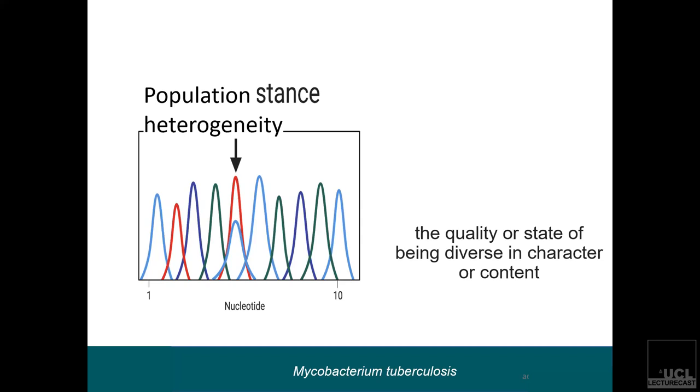We tested the PCR version out, but you get more gaps. For some reason the PCR just doesn't work as well, and you get a lot more holes. I've got a really good example of the rpoB gene with the native kit: you get coverage all the way across, like pancakes flattened across it. With the PCR one, you just get a stack of pancakes and the rest is missing. So if the resistance SNP is in a region that is missing, you will miss it.